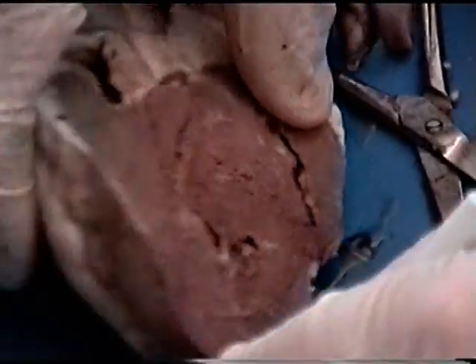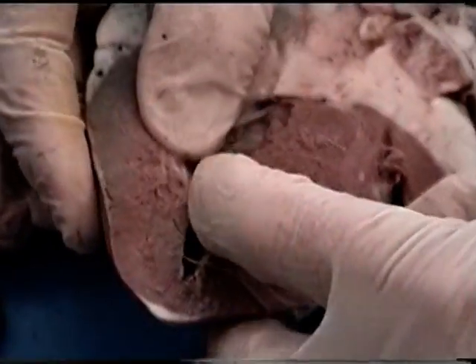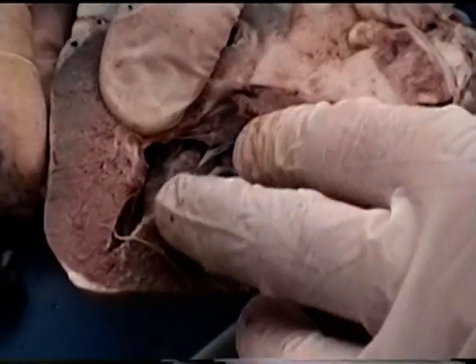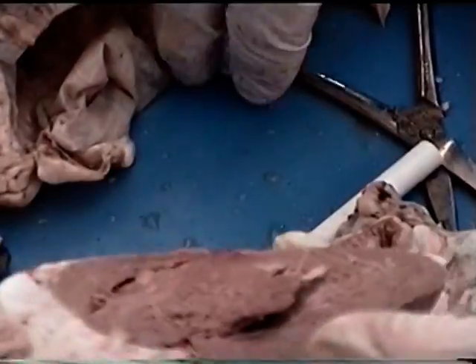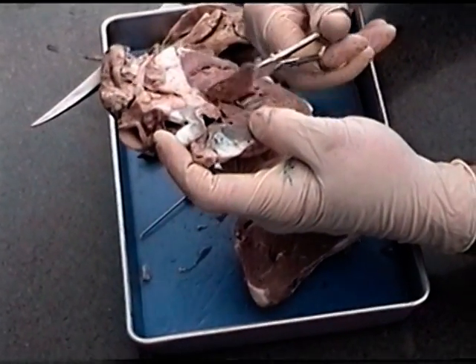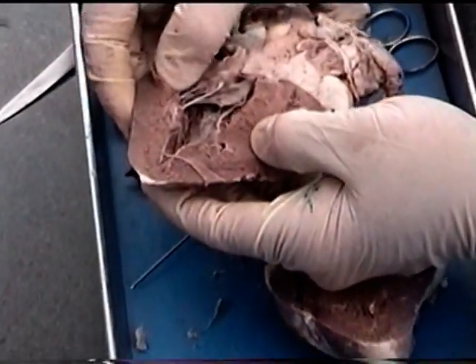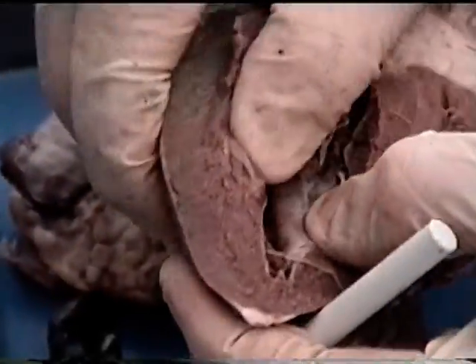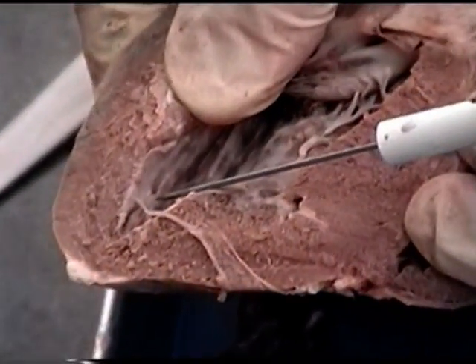Now if we look at this side of the heart and we separate this out, then what we're seeing is the left ventricle over here. And you can see that the myocardium in the left ventricle is much thicker than the myocardium in the right ventricle. So we're going to clean this up just a little bit because I didn't quite get the section that I wanted because the heart was kind of at an angle. So when we move that away, we'll be able to see down into the ventricle really well. So remember, as we look down into the ventricle, we'll have ridges of myocardium that create a three-dimensional pattern. These are the trabeculae carneae.